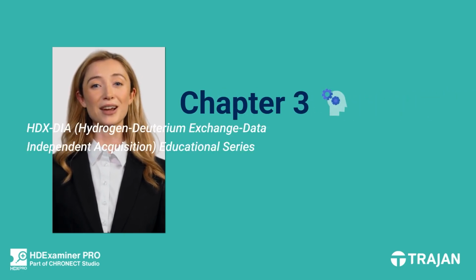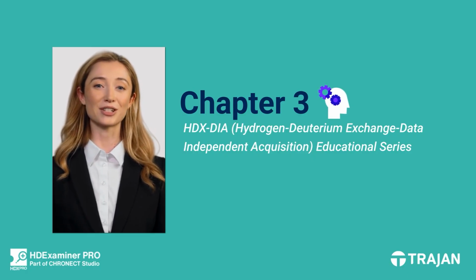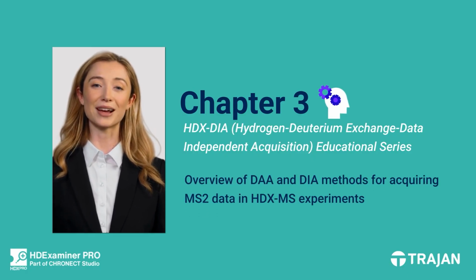Welcome to Chapter 3 of our HDX-DIA educational series. In this chapter, we will explore a crucial decision in HDX-MS experiments: how to acquire MS2 data.